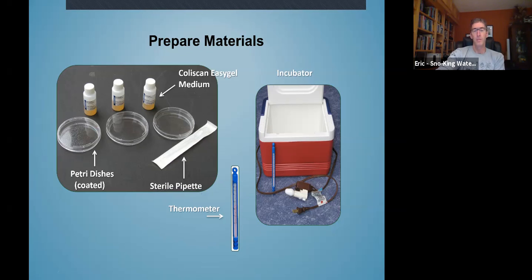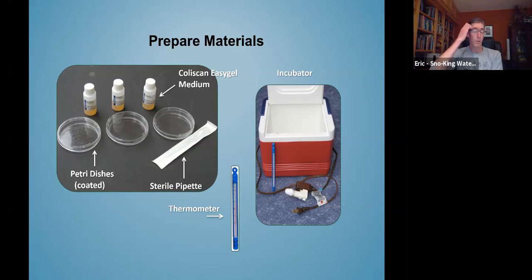We're going to use an incubator, and there are different designs of incubators that you can use. Global Water Watch teaches building a simple low-cost incubator using essentially a cooler, a nightlight, and a little cord. We originally started with that model, but we've ultimately moved to using an egg incubator with a thermostat because it's just easier to work with.